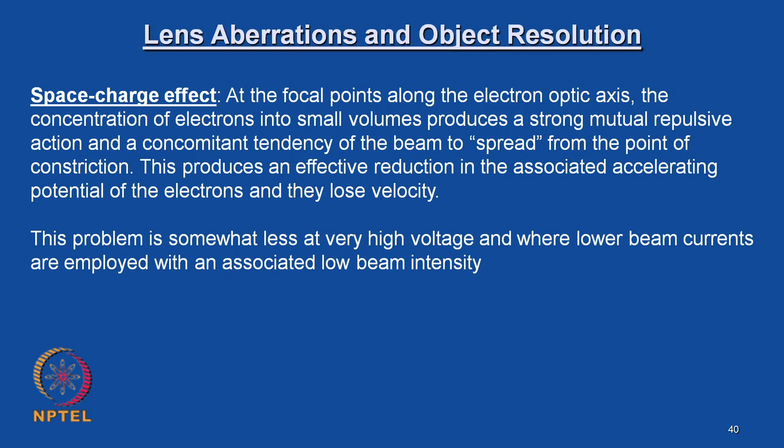Okay, so the mathematical treatment which we are going to look at is also in a similar manner, that we are not taking the specimen effect. That means we assume that the specimen is ideally prepared and it doesn't have any contamination or any other constituent reacting with the electron beam. So now we will take up these two aberrations. First, we will talk about spherical aberration.